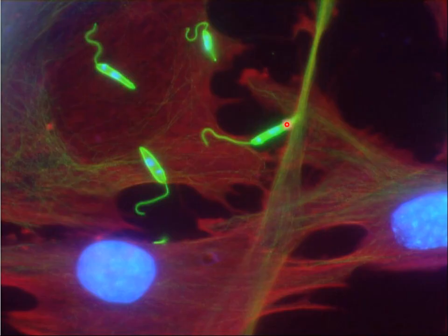And this is an immunofluorescence microscopy image also showing promastigote stages. So you can see here in green the promastigote with the flagellum located at the anterior side, the kinetoplast, which is the small blue dot that is also anterior if we compare it to the nucleus, and we have then the nucleus, which is a larger dot, stained blue according to different antibodies. So basically here again, this is the promastigote with the flagellum at the anterior part, and the kinetoplast.